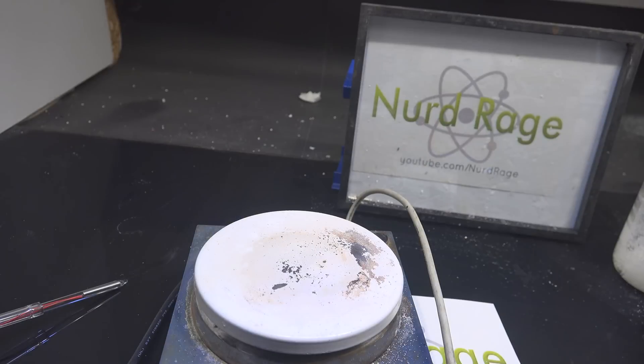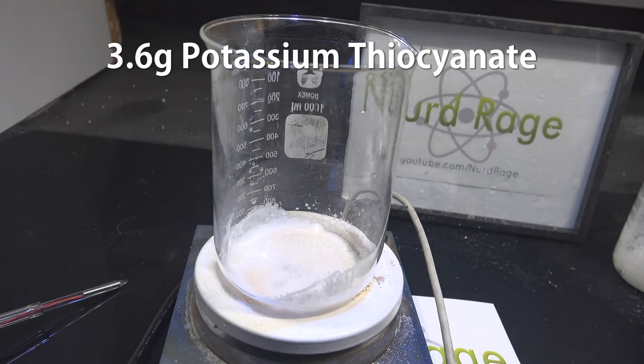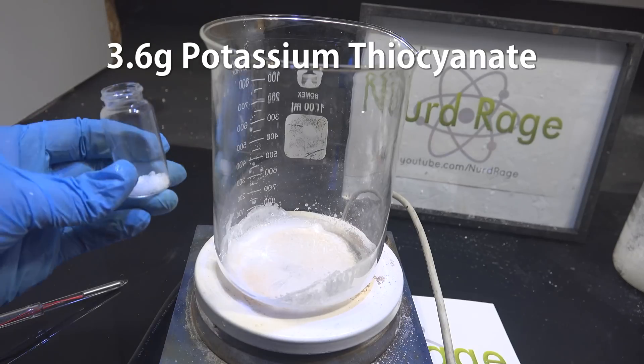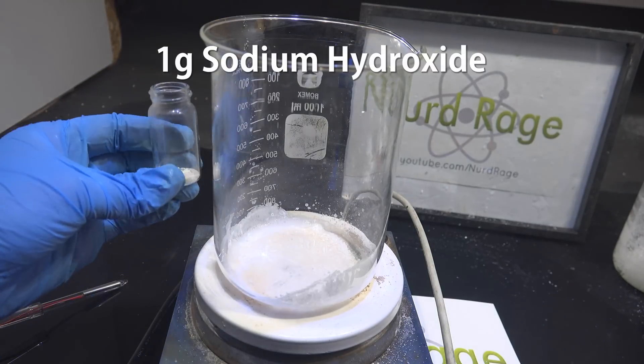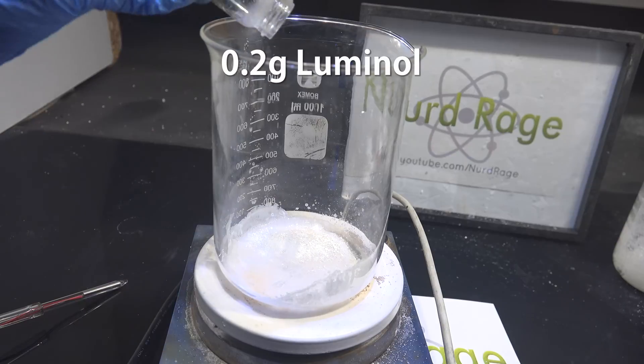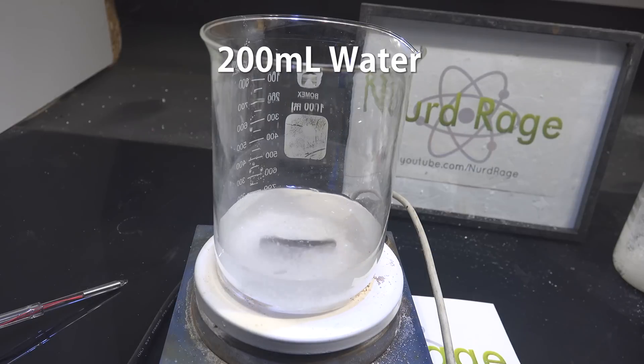While that's dissolving, in a separate larger container we start with 3.6g of potassium thiocyanate. To this we add 1g of sodium hydroxide and 0.2g of luminol. Now we add about 200mL of water and stir until everything is dissolved.